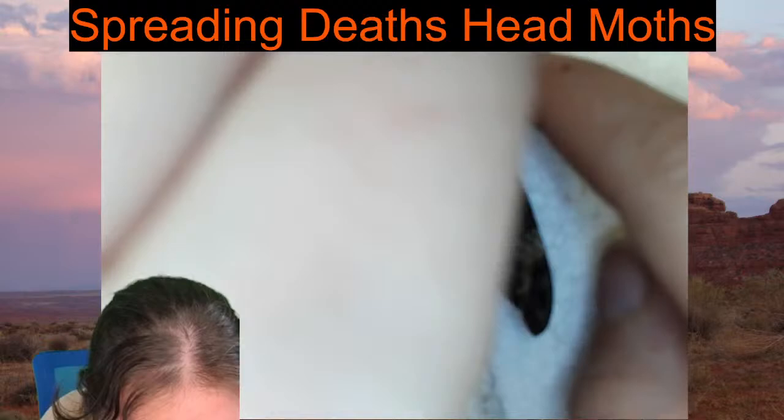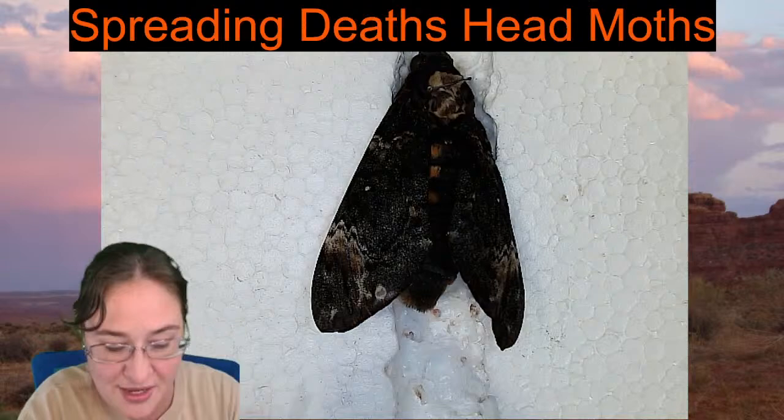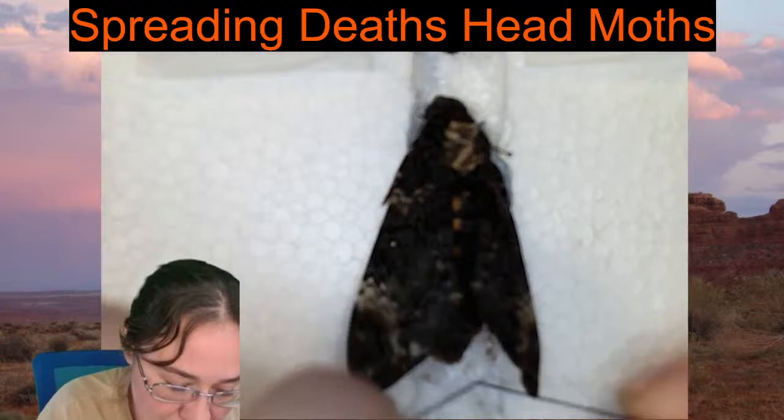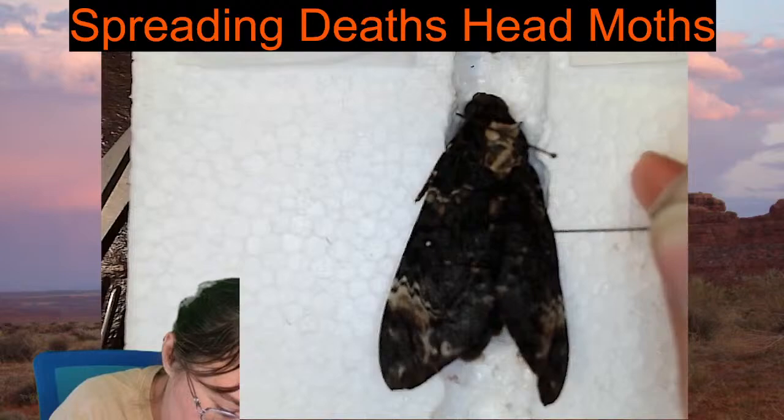All right, so I am just getting the body into this channel here. I'm crossing two pins over the body here and helping force that body down into the channel. And then I'm going to take two and bring this abdomen down also. And so they'll both be sitting in the channel. And at least in this specimen, that's kind of cool.